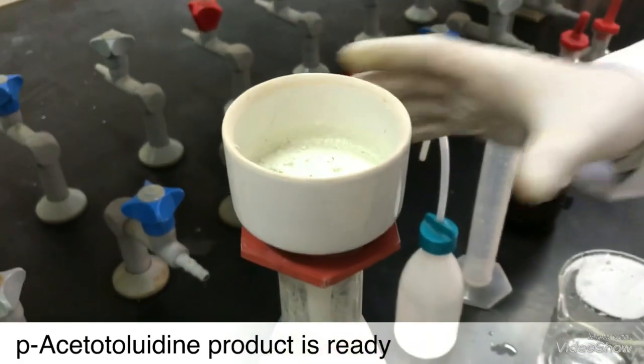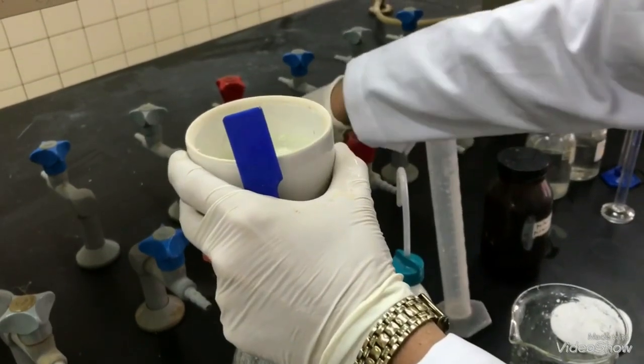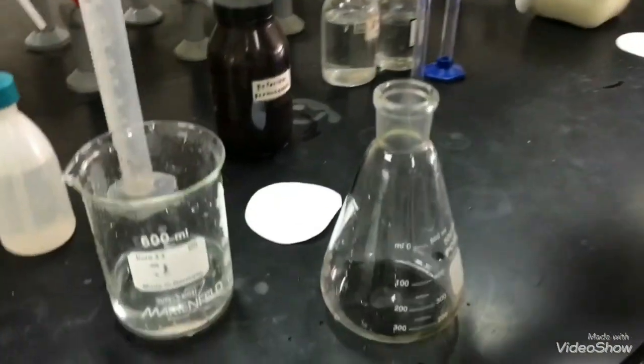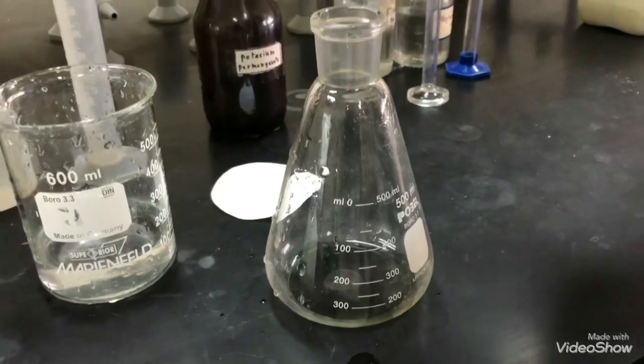Collect the whole product and put it in a 500 ml Erlenmeyer flask.